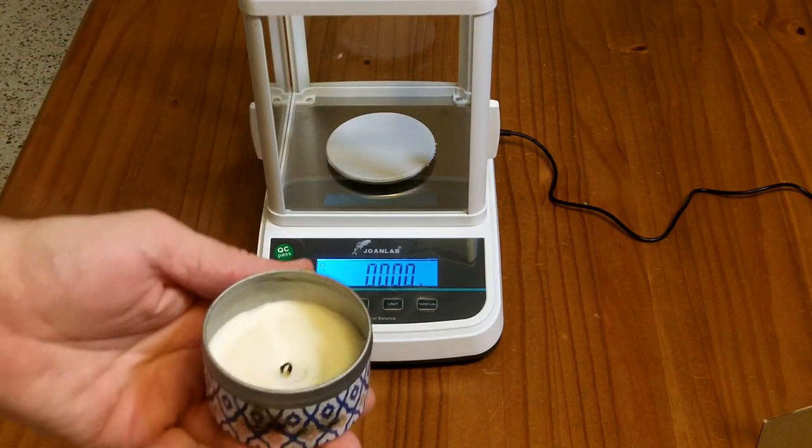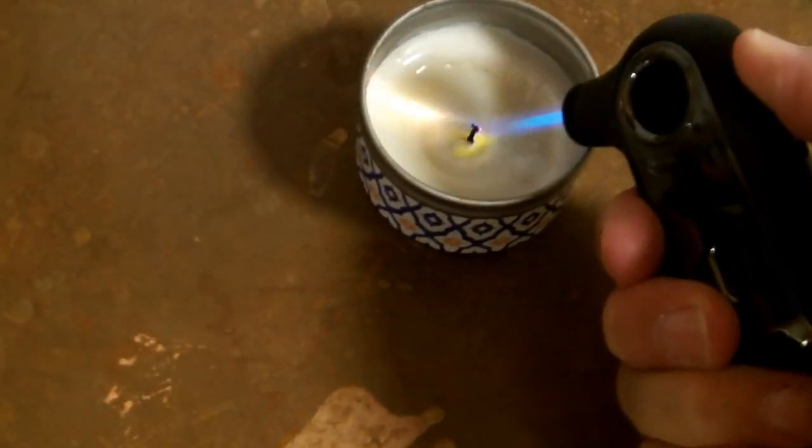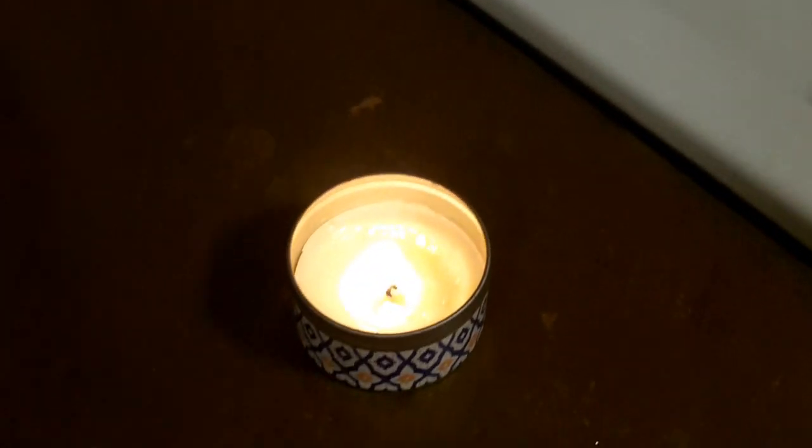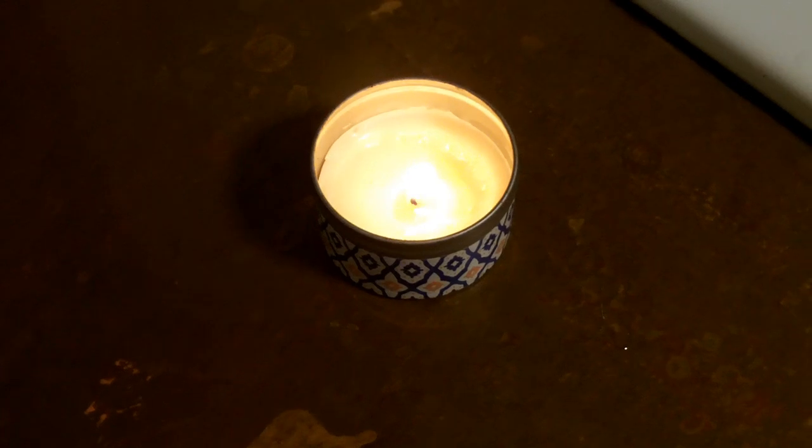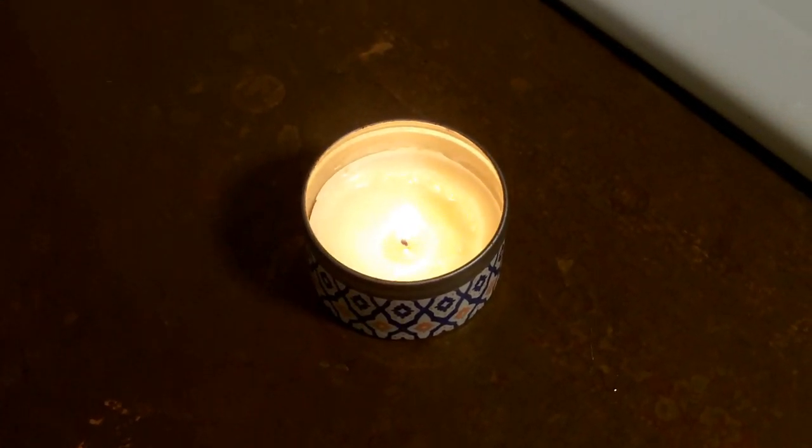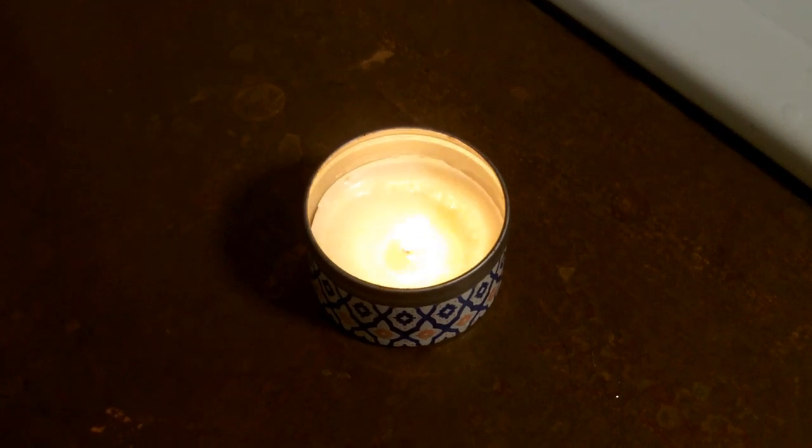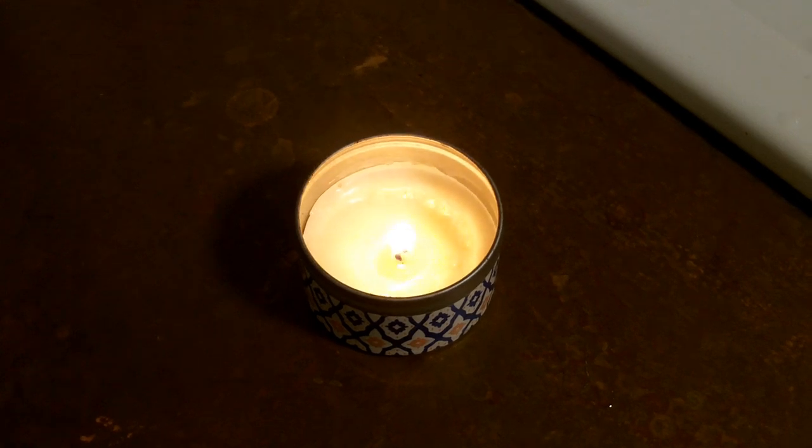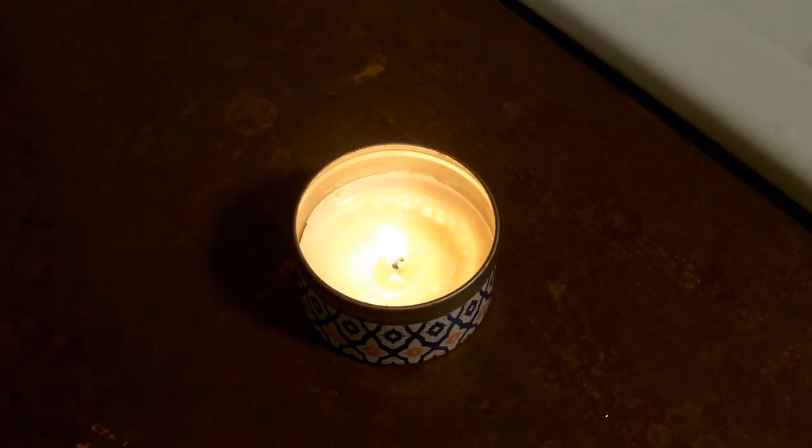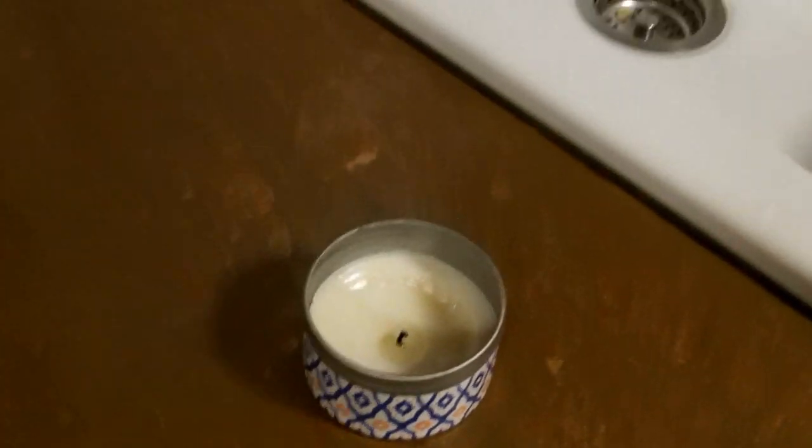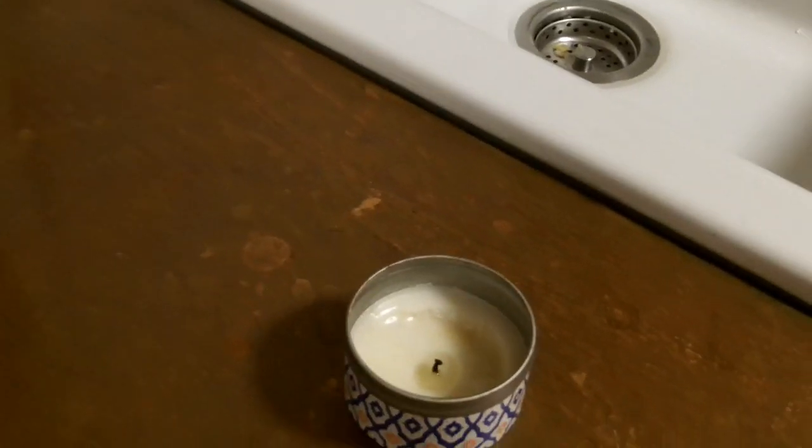You probably see where I'm heading with this. Alright, I am going to burn this candle for exactly 20 seconds. So that's been 10 seconds. And here we're coming up on 20 seconds. So you can see that smoke coming off. Those are particles escaping.